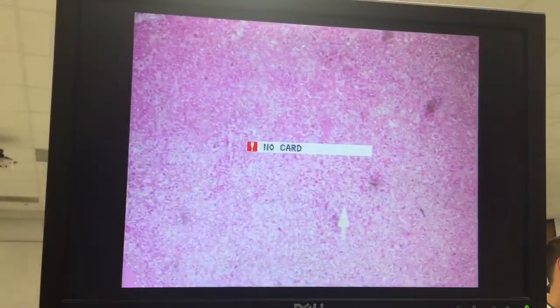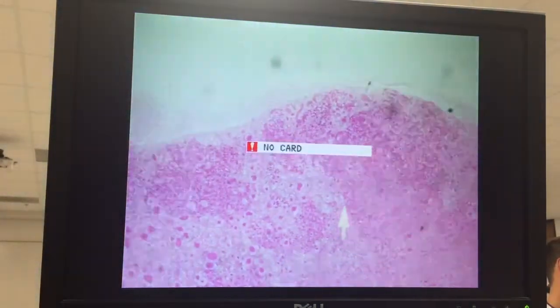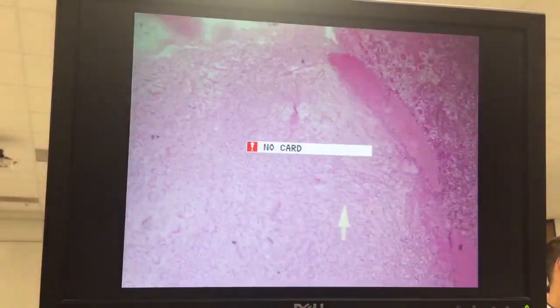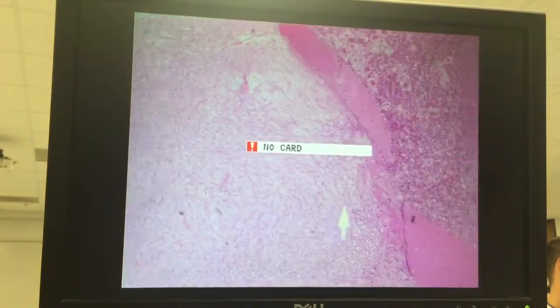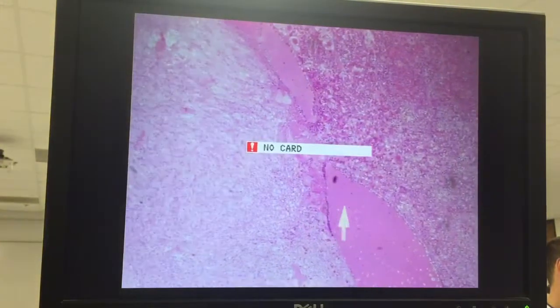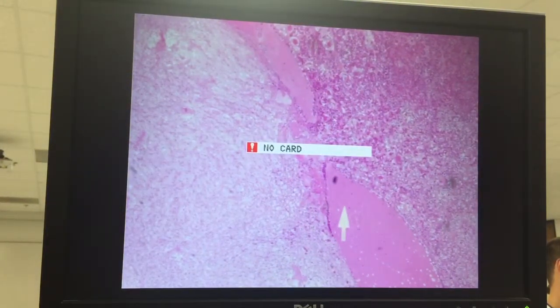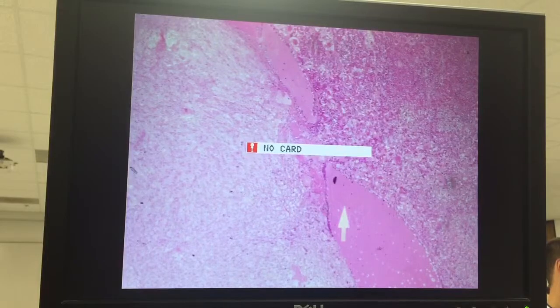We have posterior pituitary here. Here are those colloid crevices, pars intermedia.